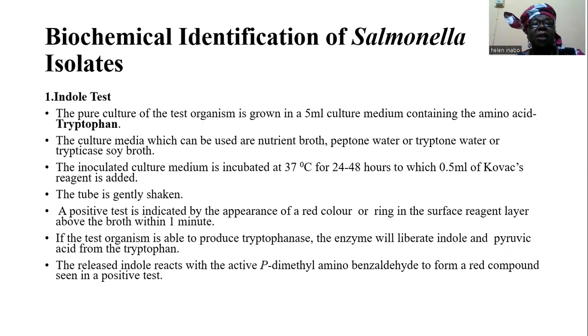The first biochemical test is the indole test. The procedure simply involves growing the pure culture of the test organism in a 5 mL culture medium containing the amino acid tryptophan. The culture media which can be used include peptone water, tryptone water, nutrient broth, and trypticase soy broth.